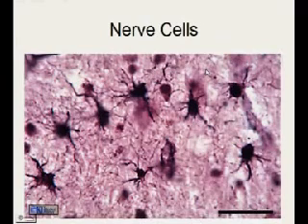Again, all of these slides are from the University of Kansas Medical Center. And this is posted on the Blackboard site, which you need to go through and look at some of these selected slides as part of your lab assignment.